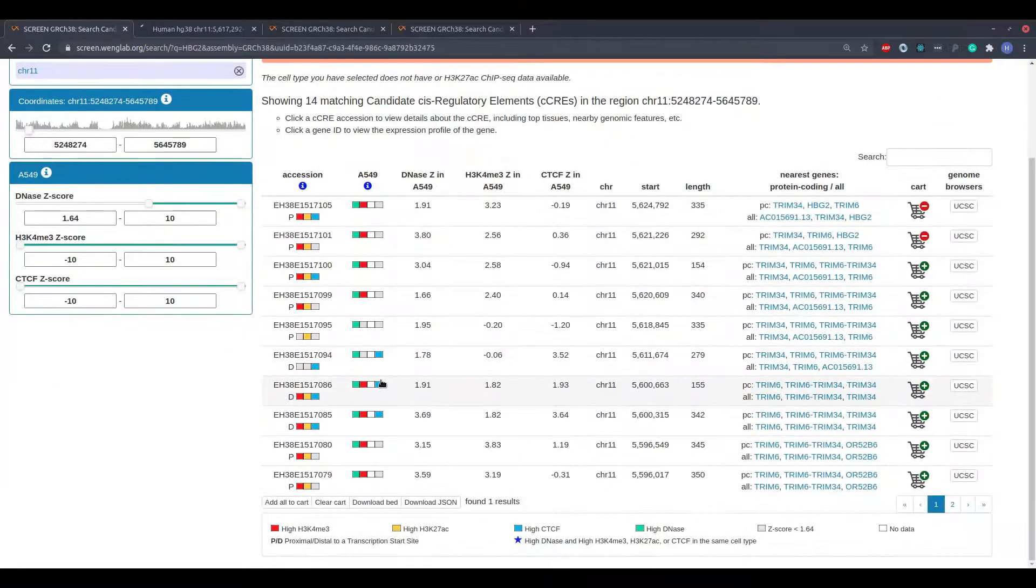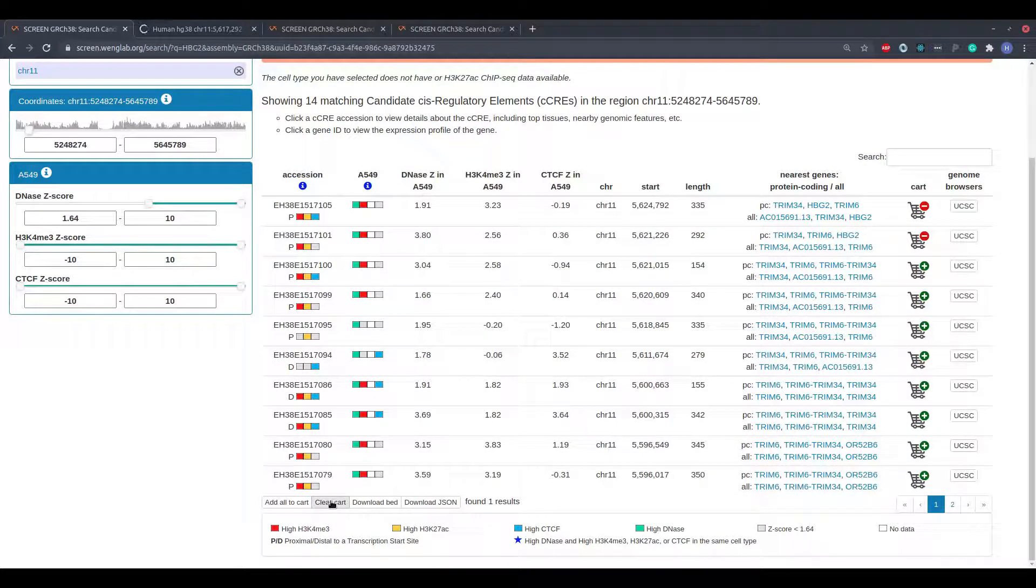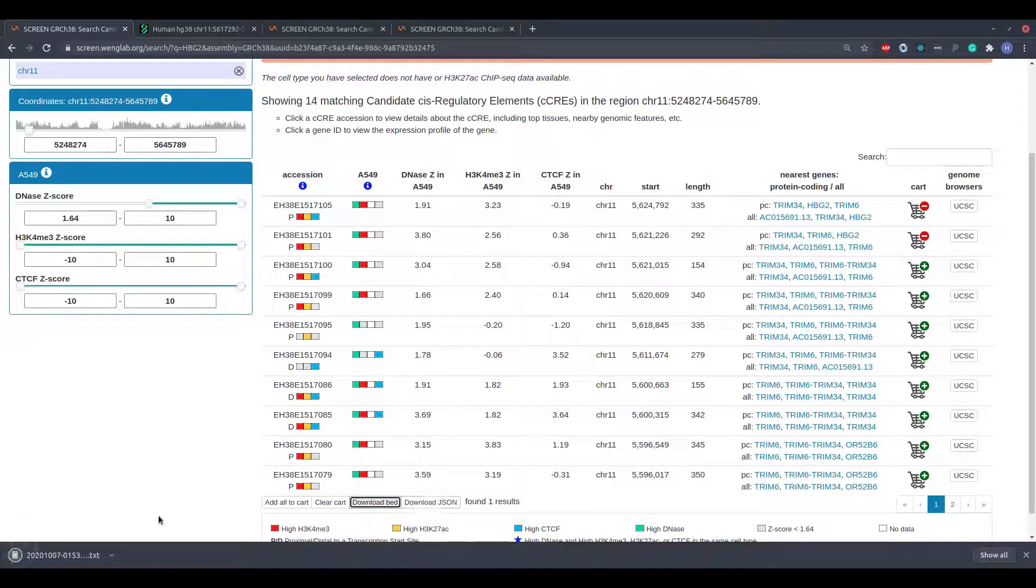The buttons at the bottom of the table allow the user to quickly add or remove all search results from the cart. The contents of the search results table may also be downloaded in BED or JSON format using the buttons at the bottom right.